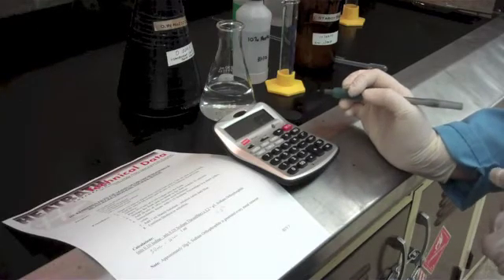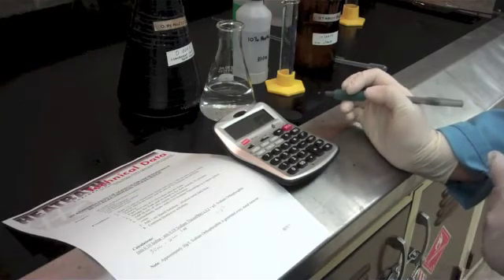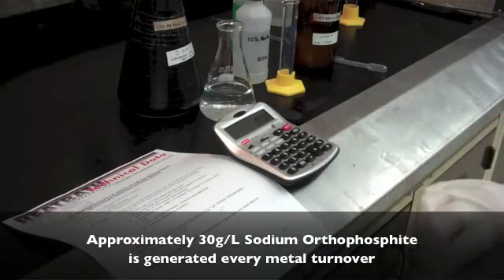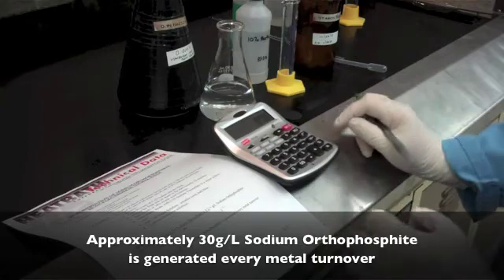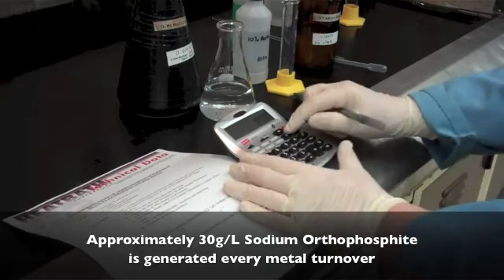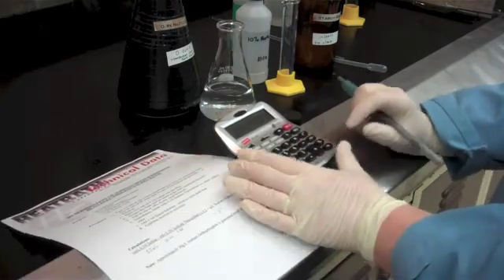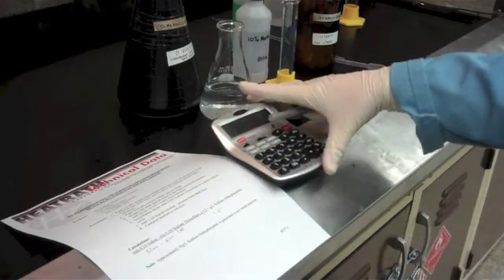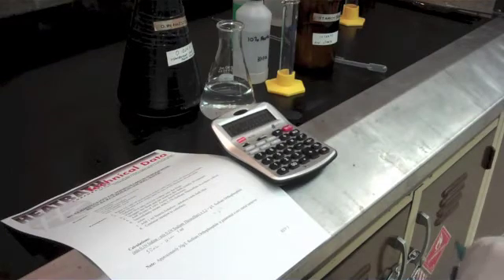For every metal turnover, approximately 30 grams of sodium orthophosphite is generated. So to find out the metal turnovers of your bath, divide your grams per liter by 30. This bath is at 6.6 metal turnovers.